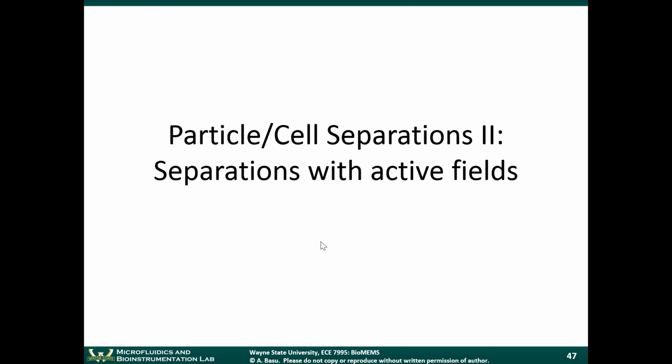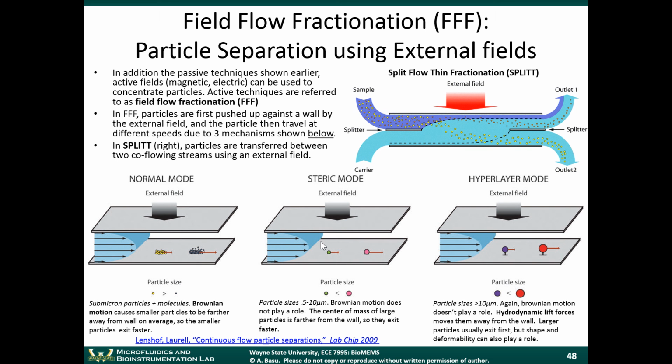If you start adding electrical fields to it, acoustic fields, and so on, you can get interesting ways to separate cells. So we're going to talk about some of those. The concept of field flow fractionation uses external fields to sort particles on the basis of certain properties.